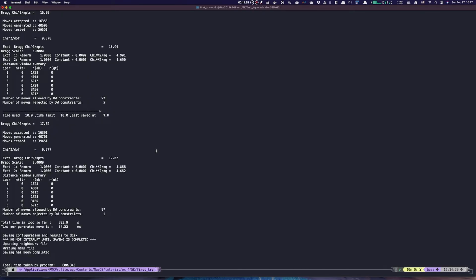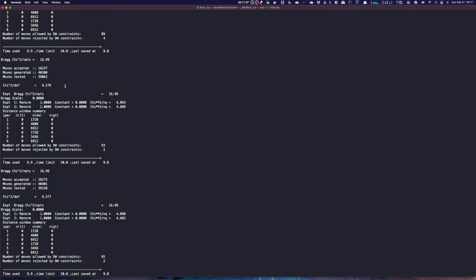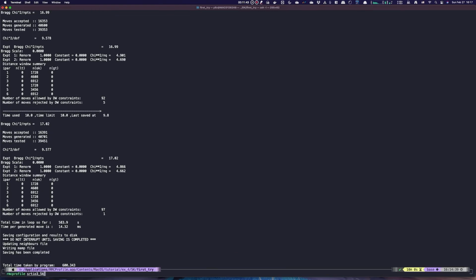Here the fitting has been finished, as you can see from the command line prompt. If you're interested in checking out this command window output, and you run directly from the command line without using job submission or management tools, you can run something like this, using the greater than sign to redirect output into a file like test.out, and if you like, you can run the whole command in the background under the Linux operating system.